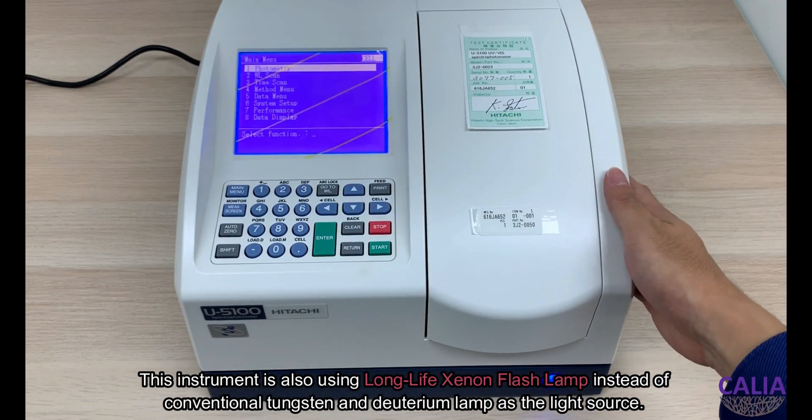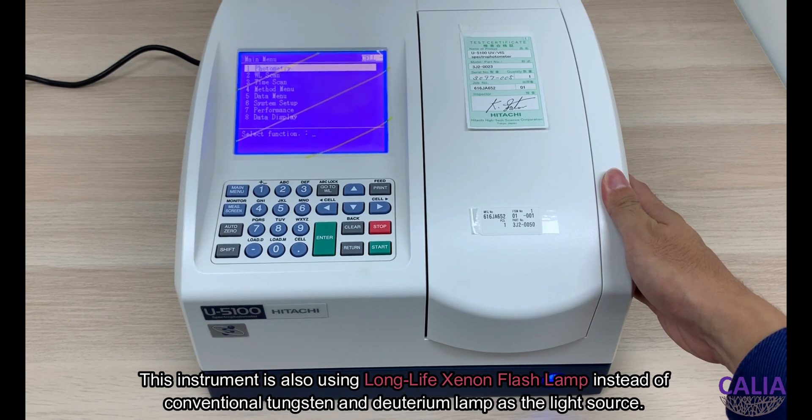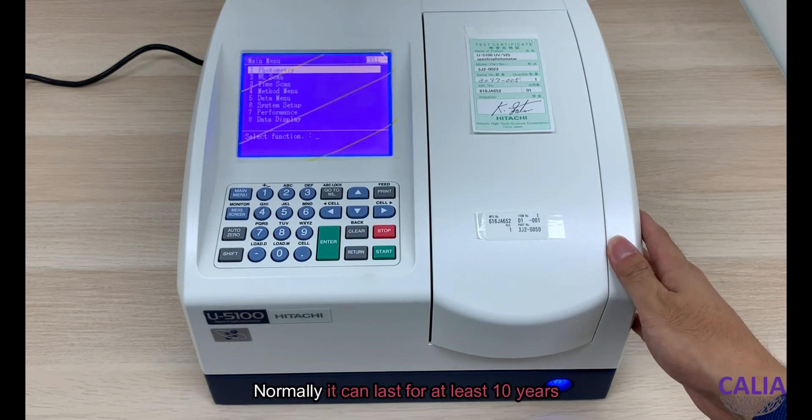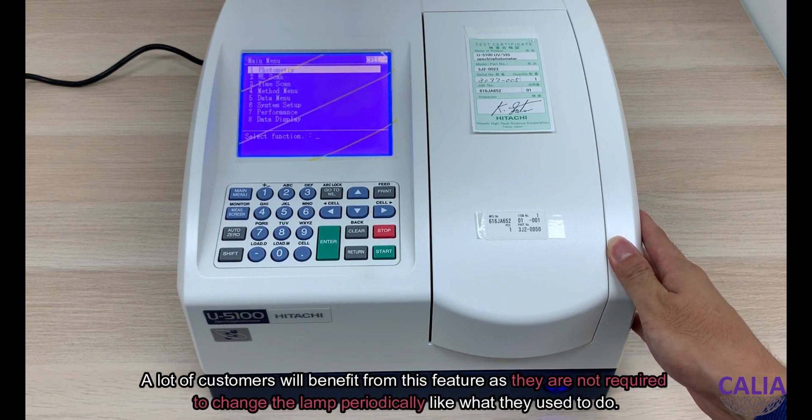This instrument uses a long-life xenon flash lamp instead of conventional tungsten and deuterium lamps as a light source. The reason we use a long-life xenon flash lamp is because it is very long-lasting — normally it can last for at least 10 years. So customers will benefit from this as they are not required to change the lamp periodically like they used to do.